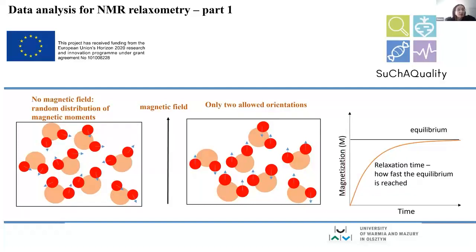They include 2 hydrogen atoms. And as you might know, in NMR, one speaks about NMR active nuclei. NMR active nuclei means nuclei which possess a magnetic moment. And hydrogen nuclei are NMR active. They are just single protons, and protons possess a magnetic moment. In a quite naive way, you see here, I indicate the magnetic moments in blue.